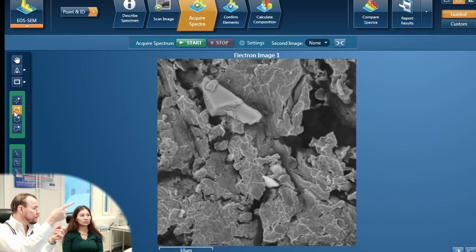So if the sample is poorly coated and is charging, that means that that image is not where we are looking right now. This was the area we were looking at 1 minute ago. But we don't know that since we don't check, right? So this is the problem if you have a charging sample.